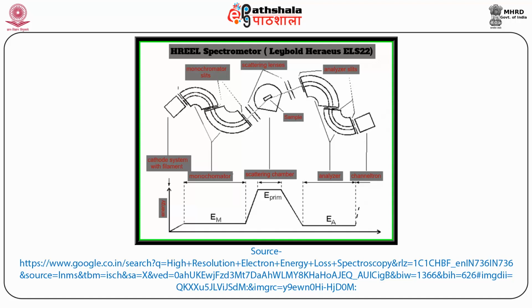Its negative charge causes the electron beam to broaden. This can be prevented by charging the top and the bottom plates of the CHA deflectors negative, which again causes a change in the deflection angle and has to be considered when designing the experiment.